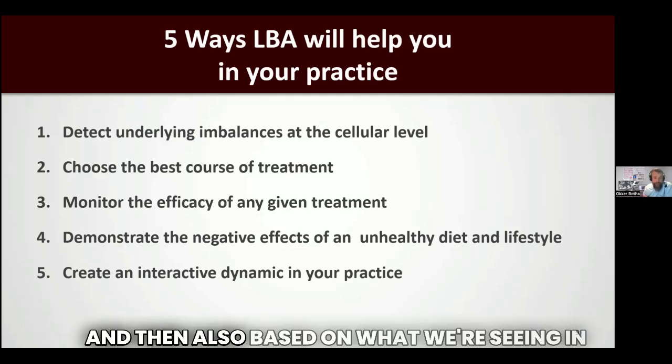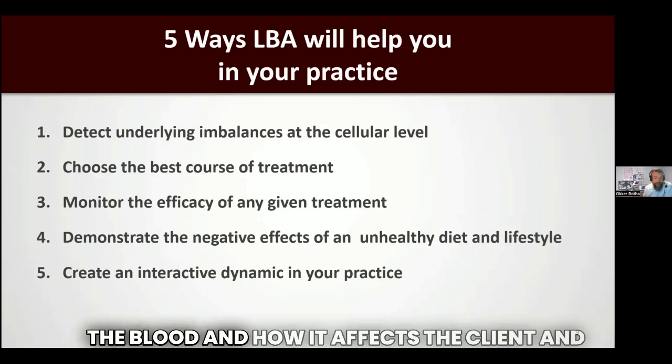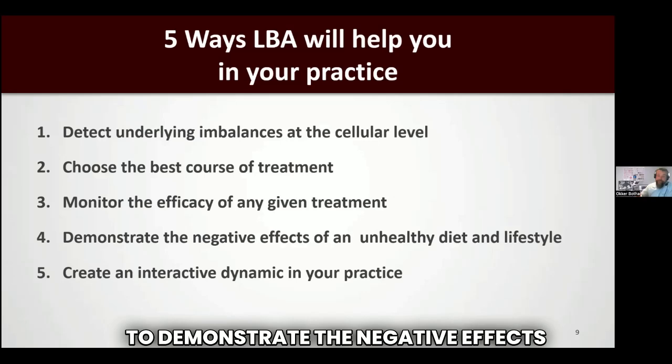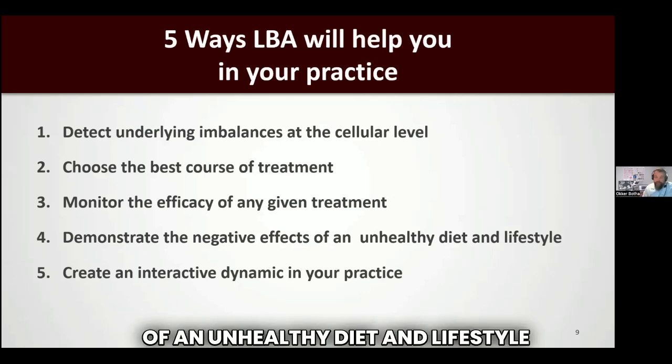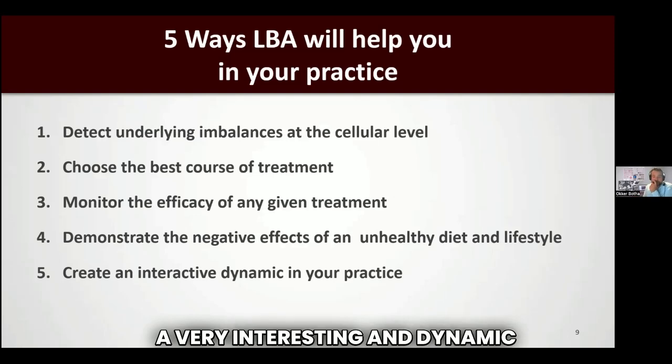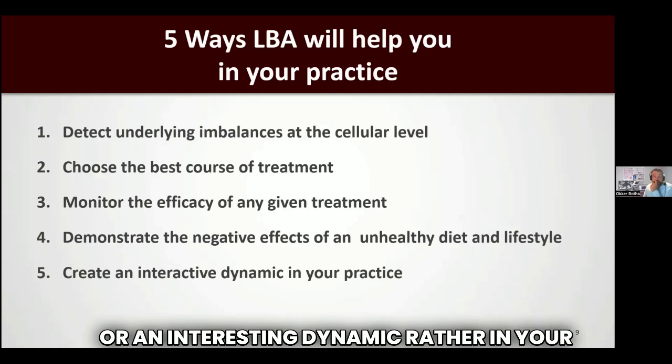And then also based on what we're seeing in the blood and how it affects the client and what they're actually seeing, we're able to demonstrate the negative effects of an unhealthy diet and lifestyle. And also it creates a very interesting and dynamic, or an interesting dynamic rather, in your practice.